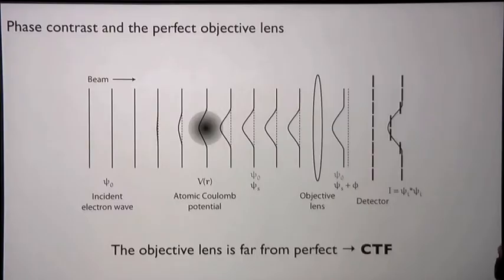All right, the objective lens. This is the business part of the microscope. I'm going to remind you of the phase contrast slide that Shore showed yesterday. So if we had the perfect lens and the perfect electron beam, it would come in as a plane wave like this, and it would interfere with the Coulomb potential of the atom, whatever atom, a ribosome atom or any other atom you want, and it will shift the phase of the wave along here.